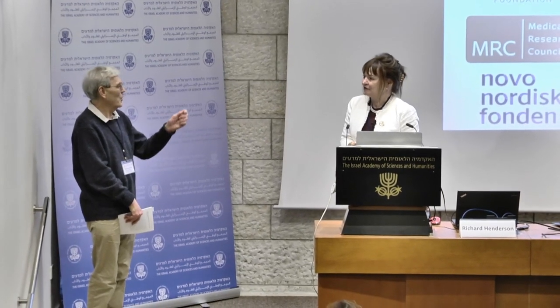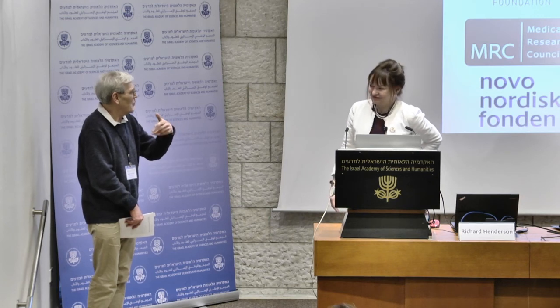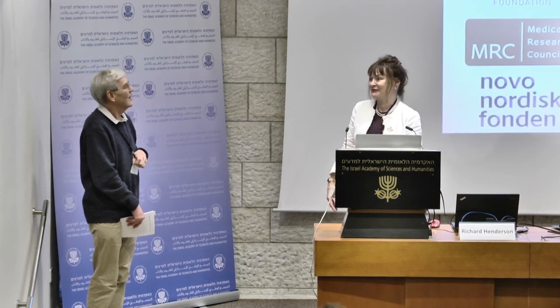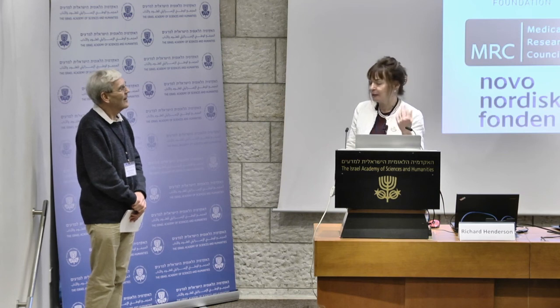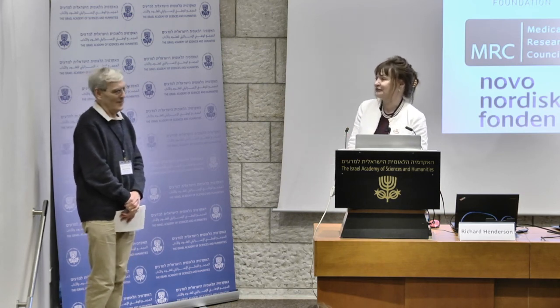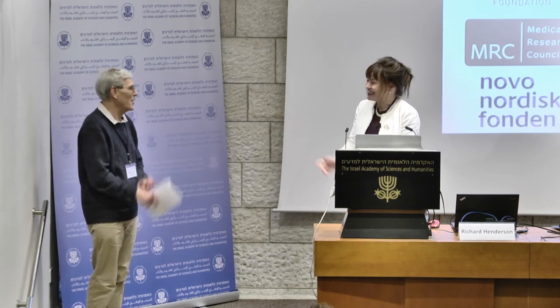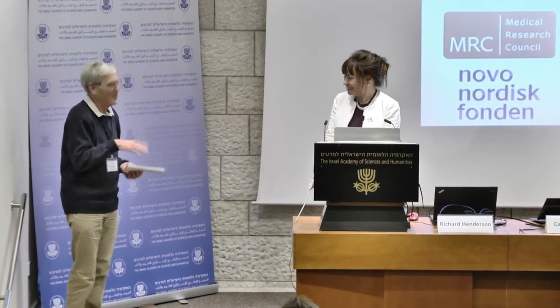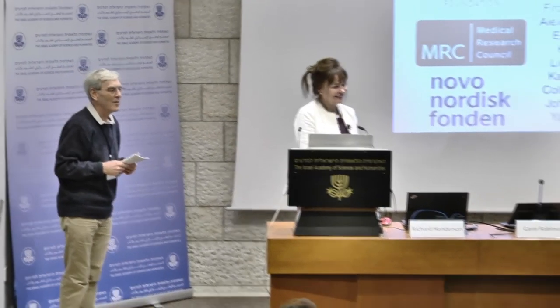You don't get enough molecules at the end of it. You get enough to get a peak, but you wouldn't get enough to do an enzyme assay, for example. No, we would. We would just collect for longer than we typically do. Currently we are collecting molecules for about an hour, and then we can have enough to do enzyme assays, to prove to people that it's still folded. And it's just interesting. It could be that there's some subtle thing, you know. One residue goes like this, and then you have to bring it back. Anyway, I will ask another question.